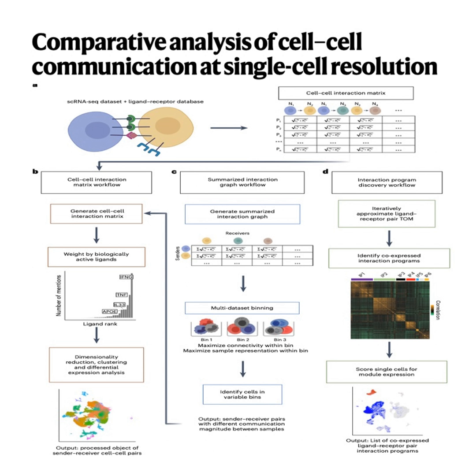All right, so our mission for this deep dive: unpack Scriabin. How does it work? How does it handle huge data sets? And crucially, what hidden biology does it actually reveal? That's the plan. We'll look at its core workflows and show some examples where it found communication networks that were just invisible before. Let's start at the beginning then, the basic unit. How does Scriabin actually score the interaction between one single sender cell and one single receiver cell?